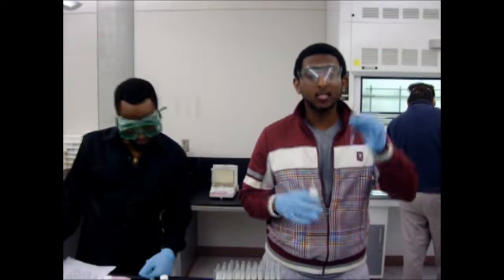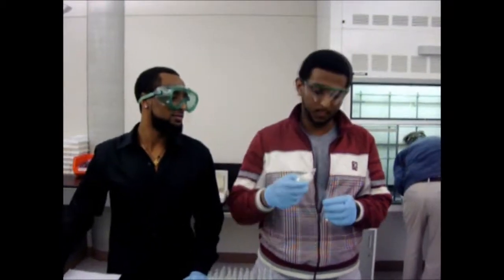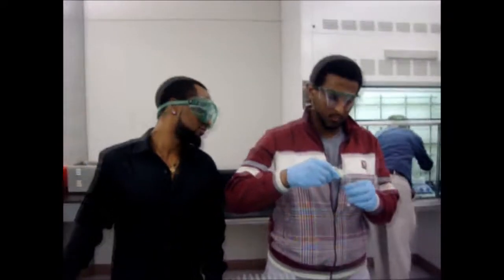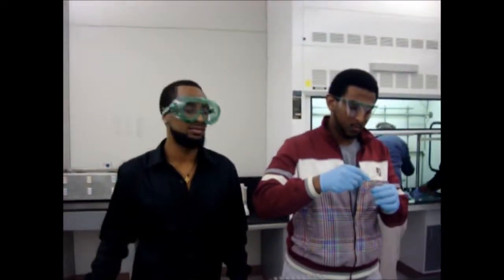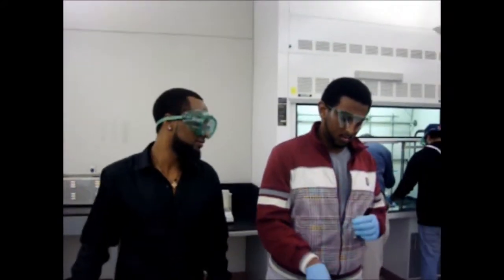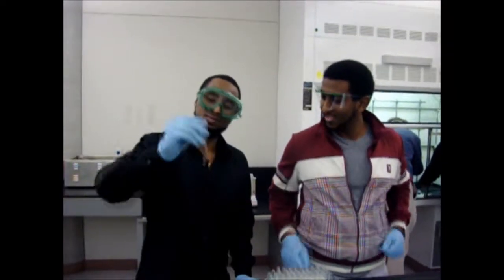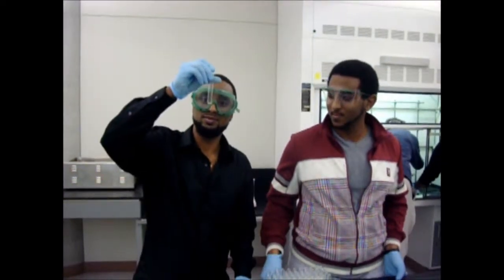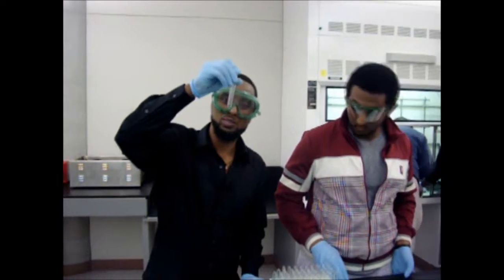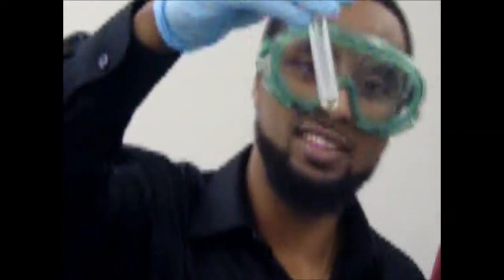Alright, so I just added my lidocaine right now, and I'm about to add my forensic ninhydrin. Fifth drop. Partner, you want to shake it up? So it has appeared to dissolve, and it sustains the original color that the ninhydrin carried.